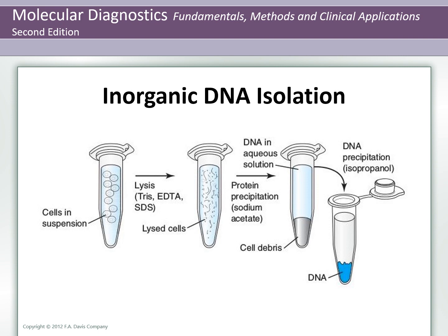This schematic shows inorganic DNA isolation. Remember, I mentioned before there are safety concerns with caustic reagents such as phenol, so inorganic DNA isolation methods were developed. Initially, inorganic methods did not provide the efficient recovery of clean DNA achieved with phenol extraction. However, newer methods have proven to produce high-quality DNA preparations in good yields. Low pH and high salt conditions selectively precipitate proteins, leaving the DNA in solution. The DNA can then be precipitated as described in the organic method using isopropanol, pelleted, and resuspended in TE buffer or in water.